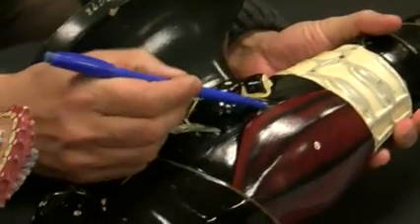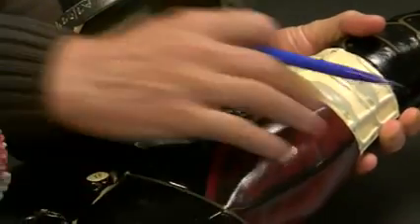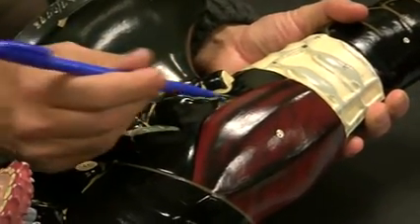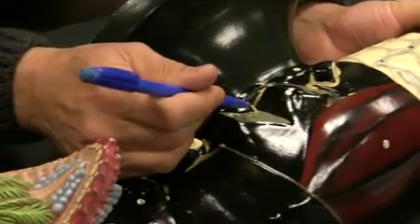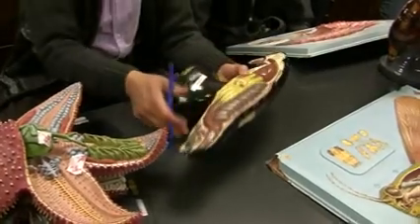Here is a tympanic membrane, very small one. When you dissect, pull the wings apart so that you can see the tympanic membrane. Tympanic membrane is used for balance when they fly. These would be coxa gland, and then I'll show you where the coxa and everything else is in a minute. So that would be pretty much the external anatomy of these guys you should know.